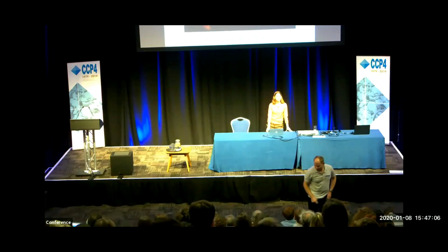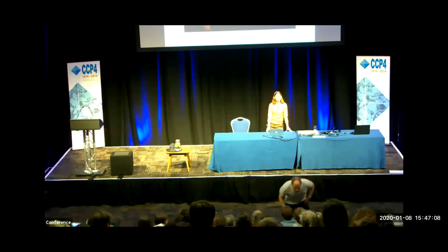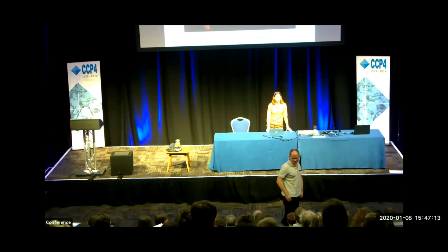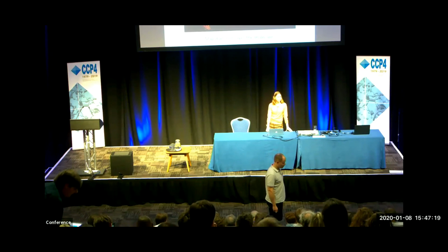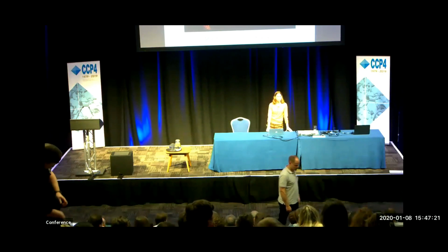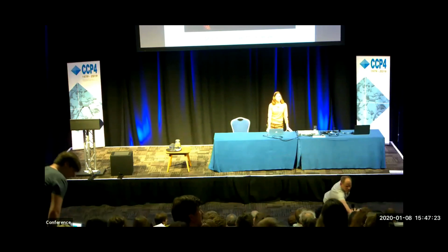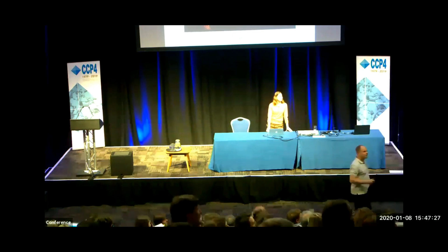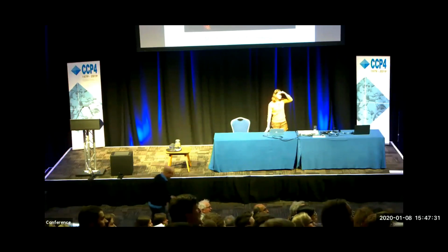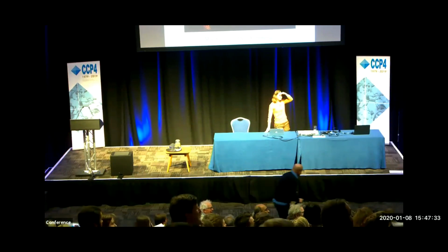I guess this is a question to the PDB, but what validation are they using? Surely any validation procedure should notice that, shouldn't it? Yeah, I don't know if the PDB actually ever sees the map when the model is deposited. I don't know about that. Maybe someone from the PDB can comment on that.